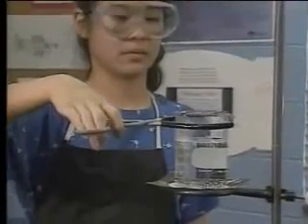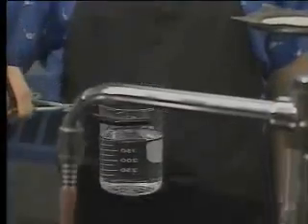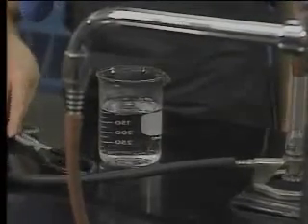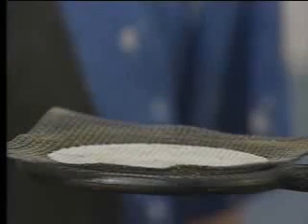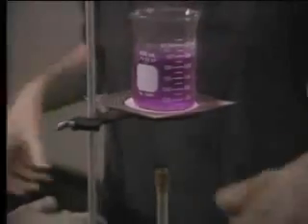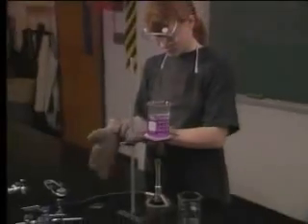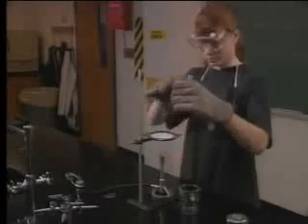Be extra careful when working with heated equipment. Hold hot glassware in beaker tongs, never your hands. Remember that the wire screen and ring stand are also hot. If you don't have tongs, protect your hands with gloves designed for hot glassware. Keep them away from the flame.